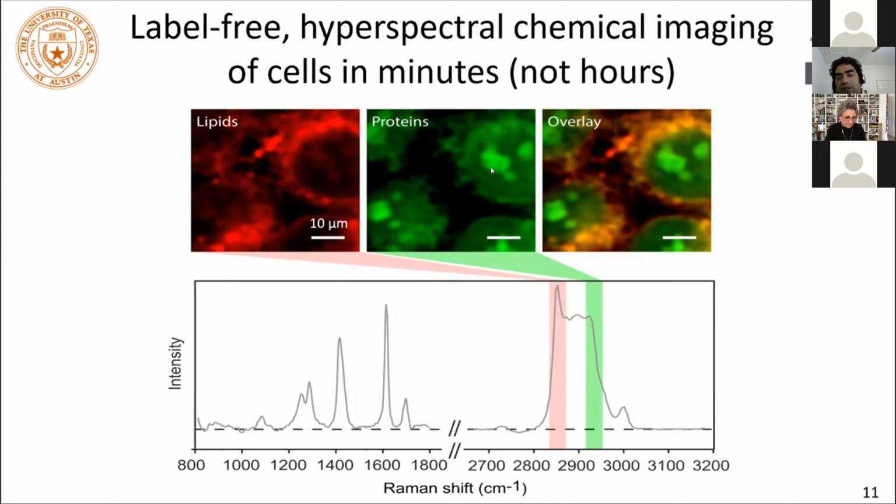That's something that, if you think about it, is kind of unique and also difficult. This is where you make the invisible visible. It's really hard to look at all lipids and all proteins in a sample. Just stop and think about it. How do you look at every single protein in a sample if you wanted to ask a really general question about what happens to proteins or lipids during cytokinesis? Everybody knows what happens to certain proteins or certain parts of the nuclear envelope or cell membranes during cytokinesis. But how hard is it to ask what happens to all of them, or an entire distribution of them?